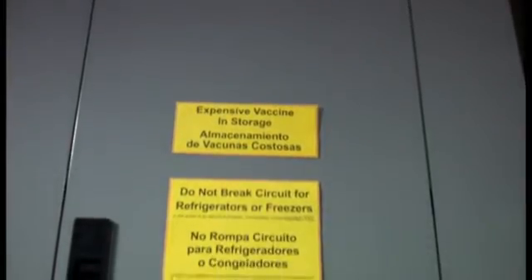At your circuit breaker, mark the switch that controls power to the refrigerator and freezer, and post another sign warning personnel not to turn off this breaker.